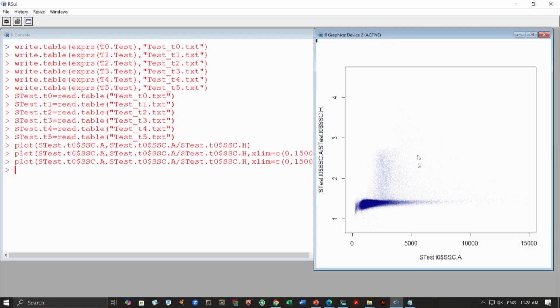What you see on top are actually the aggregates. This is where we have the aggregate cells, and here you see the main cluster of cells. Visually, this number is around 500 or 1000. So let's draw a line here. We have to separate out these cells, which are likely to be debris and some background noise, and we also have to separate out these aggregates.